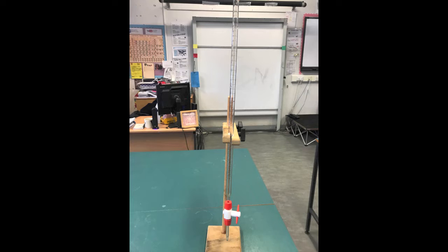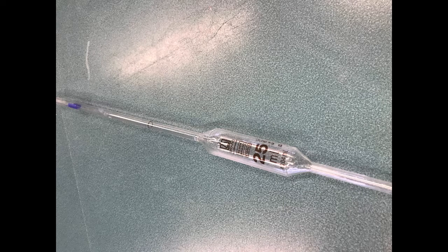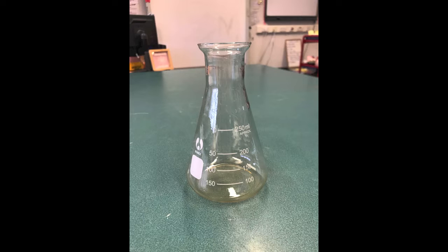The equipment used in titrations are burettes to deliver solutions into a flask during the reaction, a pipette to measure a known volume of solution at the start of the reaction, and a conical flask to carry out the reaction in.